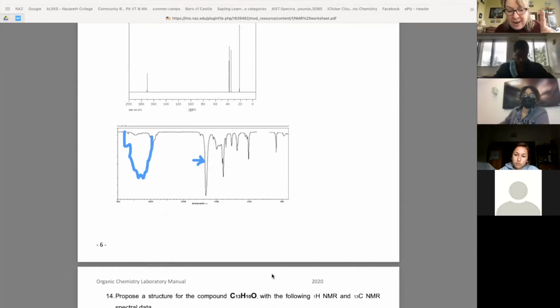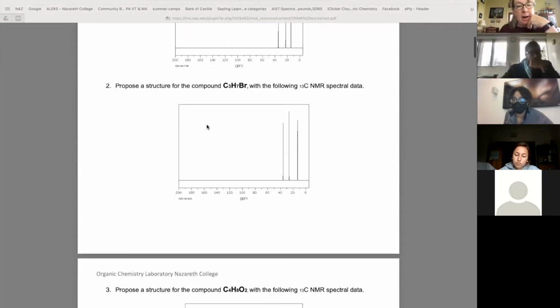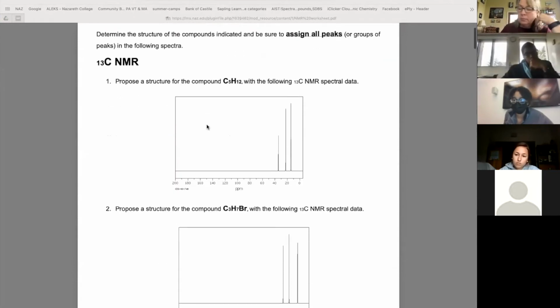Kiara asked about question number one, so I'm going to do that, and then I'll come back to you, Jacob, okay? But you'll never have a peak going up on IR when the spectrum is in transmittance mode, because the line is up, so it's down. If you have a peak going up on IR, you should redo it and do a background first. So the jigsaw is multiple down peaks, not up and down peaks. They're down peaks only because the line in general starts at the top. Okay, that makes sense then.